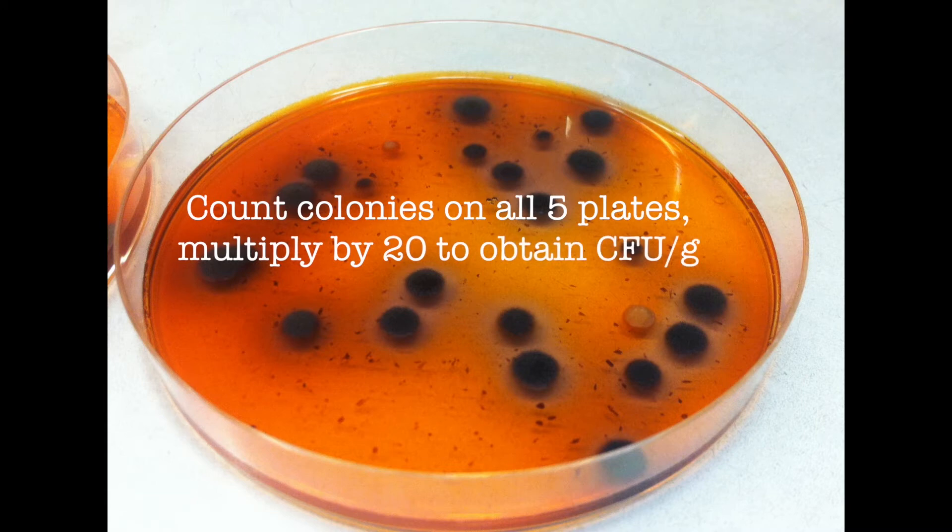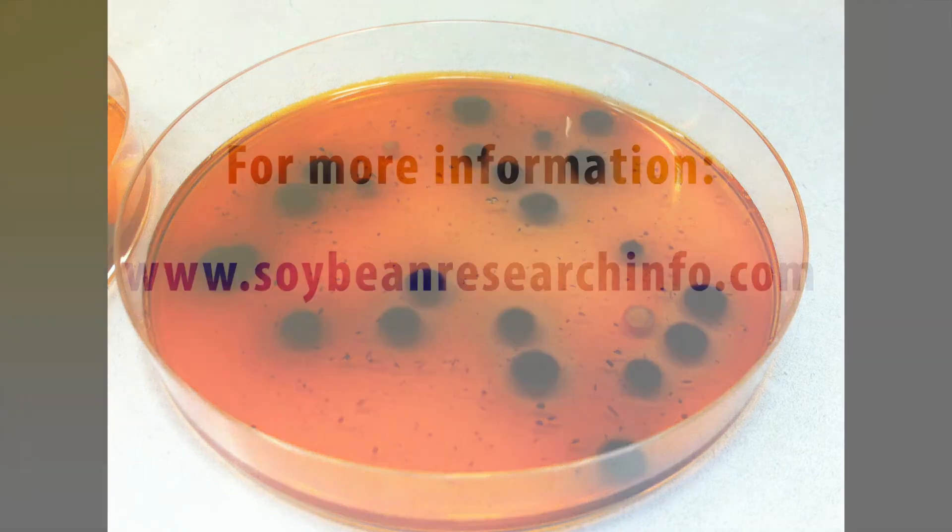You need to count the colonies on all five plates per sample and multiply by 20 to obtain the colony forming units per gram of soybean stem tissue.